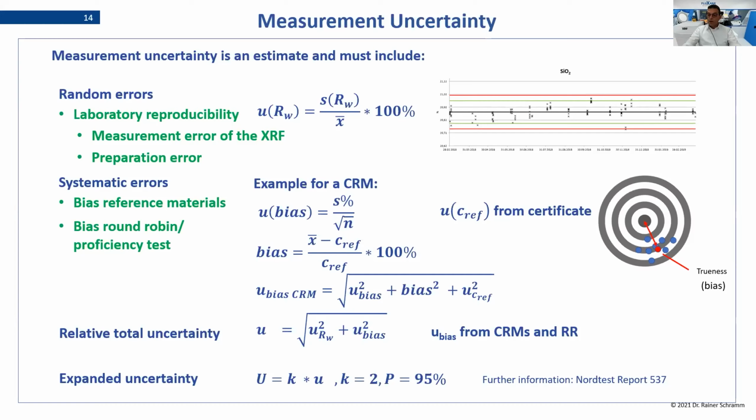So then we have another question. We have a calibration covering several matrices. How to select a blank sample for determining the LOD in this case? Okay, normally when you have different matrices, you will also have different elements you are looking at. So you are absolutely right, you have to determine the LOD in each matrix. And what we do then is that we take the worst one, so the highest LOD, to be safe, so that for all different samples we are on the safe side.